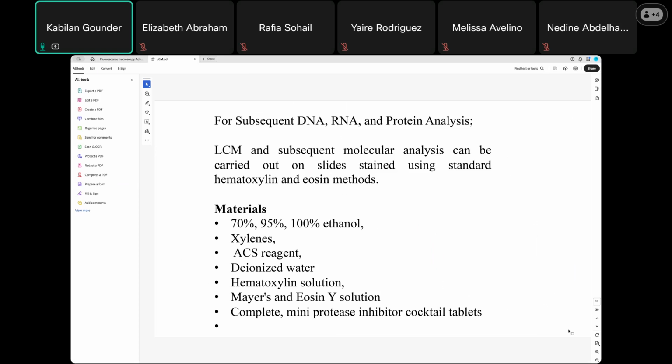We already discussed the staining. First you have to deparaffinize and then rehydrate the sample, and you stain with hematoxylin and eosin, and then again dehydrate the sample for observation. Similarly, when you take sections, you can look at the fluorescence microscopy and see all the expression and process. So these are two different methods that you can utilize, based on the structure or the fluorescence.